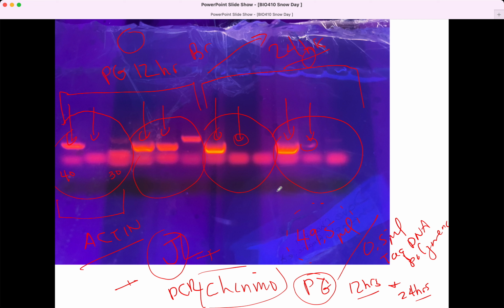Okay? I should have said at the outset, this lower fuzzy band, my lab likes to call it a primer cloud. That's because there are just a lot of primers used in the reaction to help drive the reaction forward. We have a great molar excess of primers, 50 times more primers than necessary, because we want the reaction to go very fast. We want the primers to stick to their targets immediately when we cool the samples down in the PCR instrument.